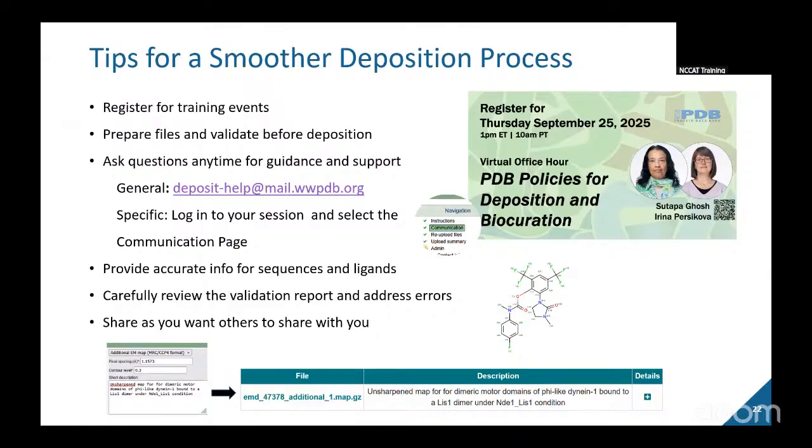Yeah, this is true. We do have a 3-year project underway right now to improve OneDep, to streamline deposition, and it involves working directly with these major software developers on trying to make it so that you have files that are deposition ready, with the metadata in there. It's a good point. I think we should go back and really think about how things have moved and be very thoughtful with what data we capture, and just assess how things are used.